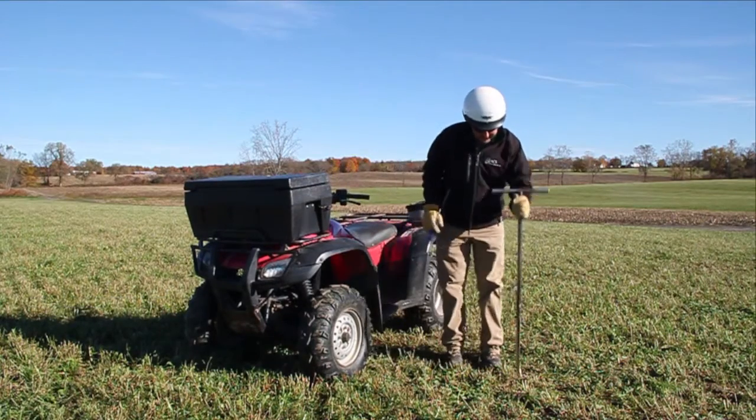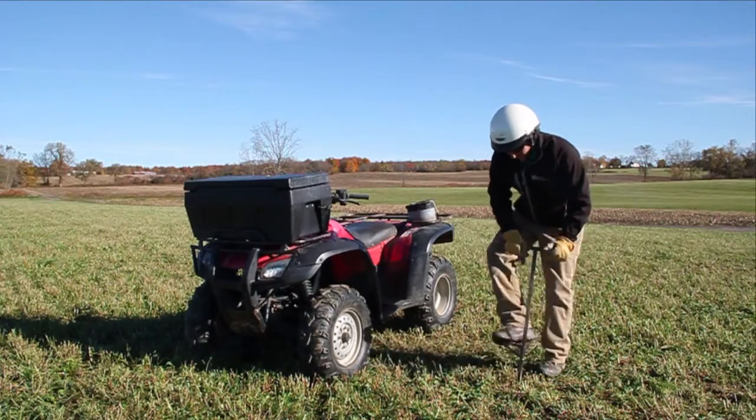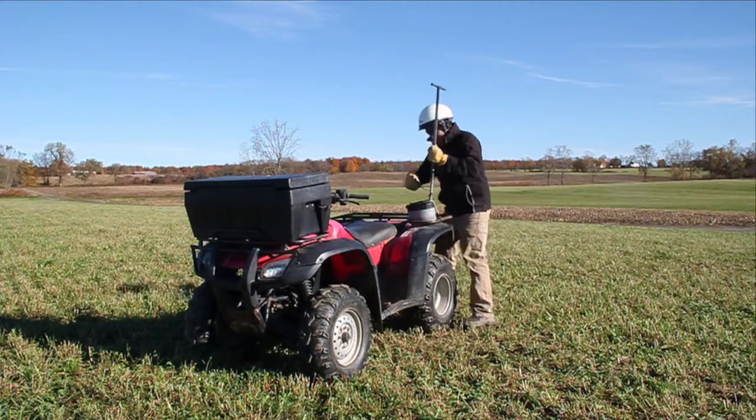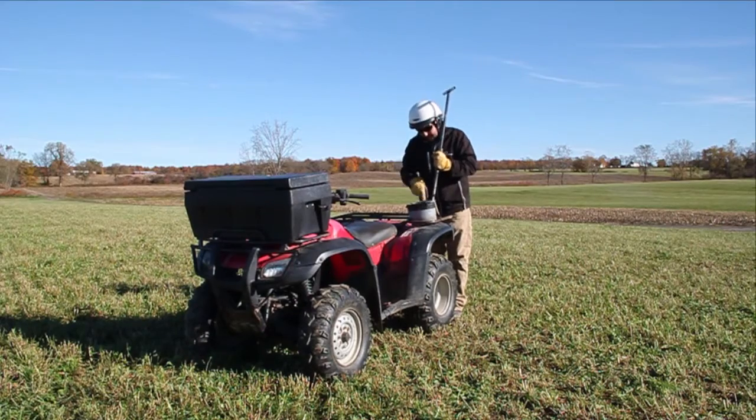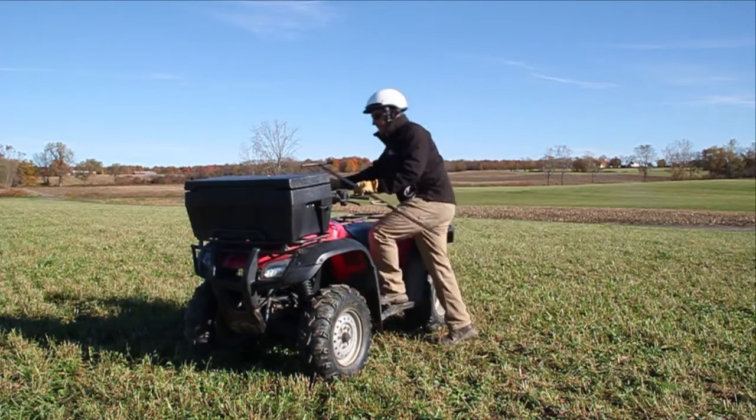Most fields we sample are 15 to 20 acres and we'll take 10 to 20 core samples per field. We drive our probe six to eight inches down for each core and then mix all those cores into a bucket. From that mixture we pull our final sample for that field.